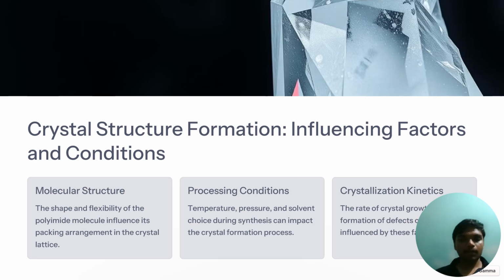Various mathematical techniques like Fourier transforms are used to solve these phase problems and reconstruct the electron density map, which shows where the atoms are located in the crystal.